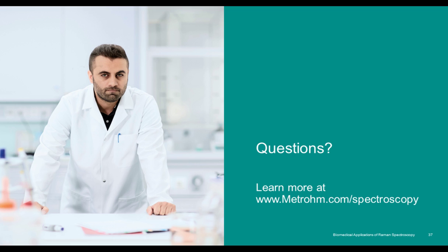Wonderful. Okay. We want to thank the audience. We've gotten so many good questions in, so let's look for another one. Okay, here's another one. How about systems which are largely complex, like environmental samples, for example, soil? Is it possible to decouple composition and interactions?